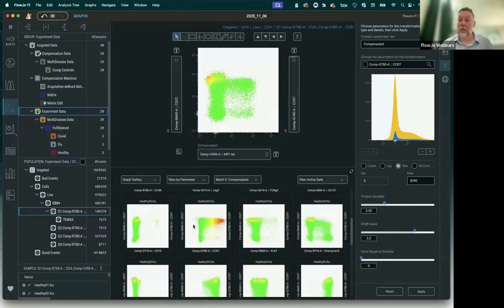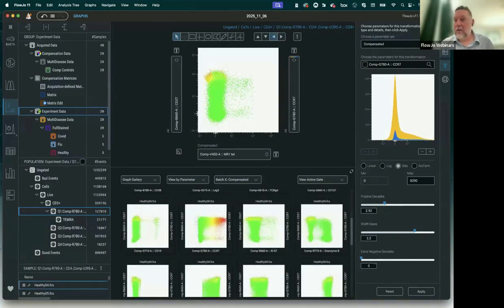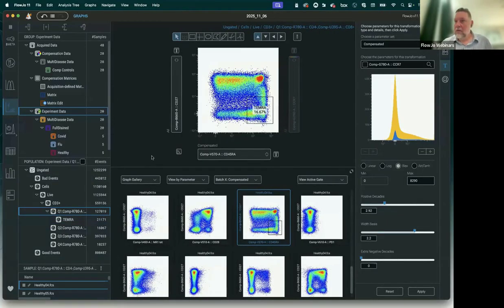So if you want it to really pop, change the transforms and spread that data out across the range of the visible plot that you have. Other navigation tools, right click, go forward or backward. But let me get into just a few other things for you guys before I run out of time.